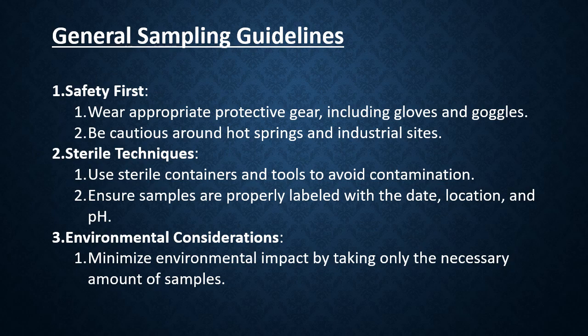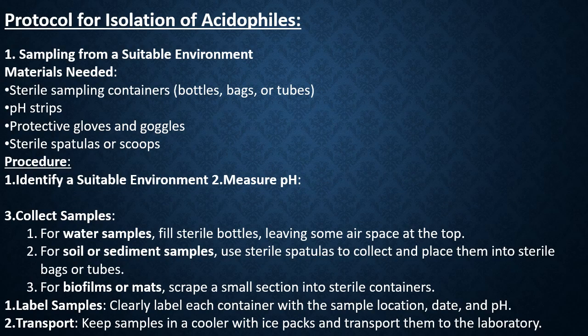Then next is the protocol for isolation. The isolation of acidophiles involves sampling from the acidic environment, so we have done that already. Now you need to use appropriate media and grow the microorganisms from the sample, and then you identify them.